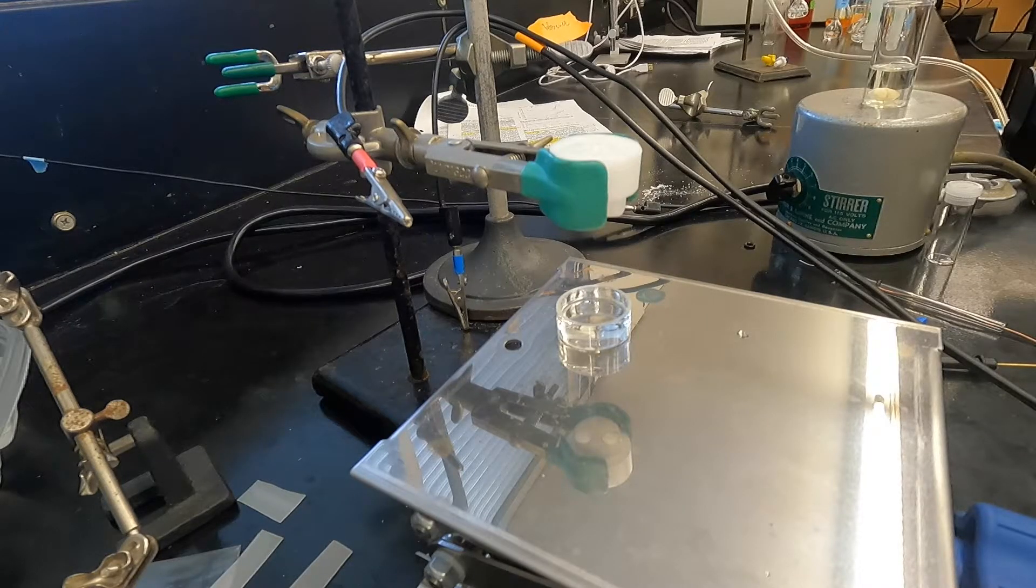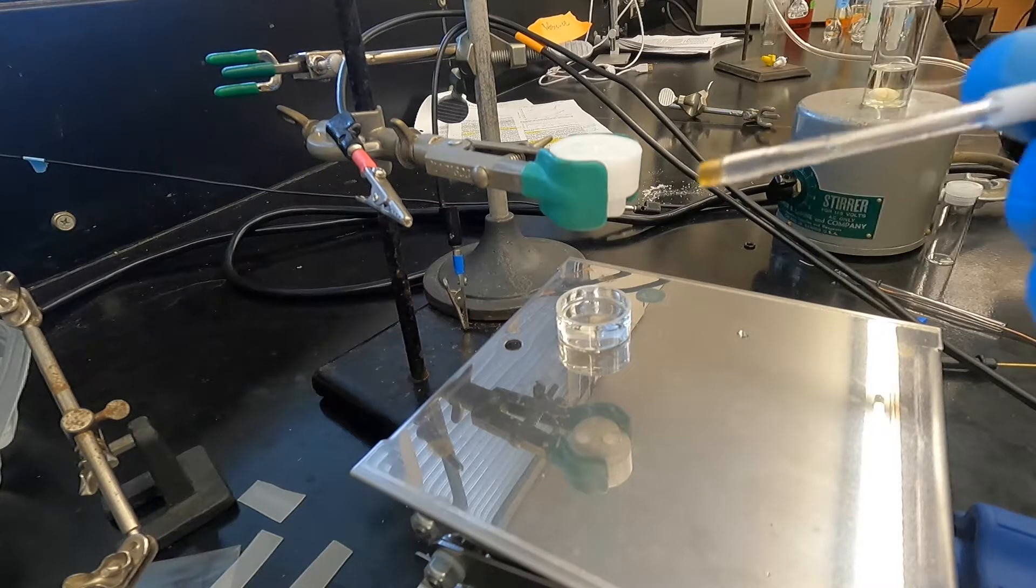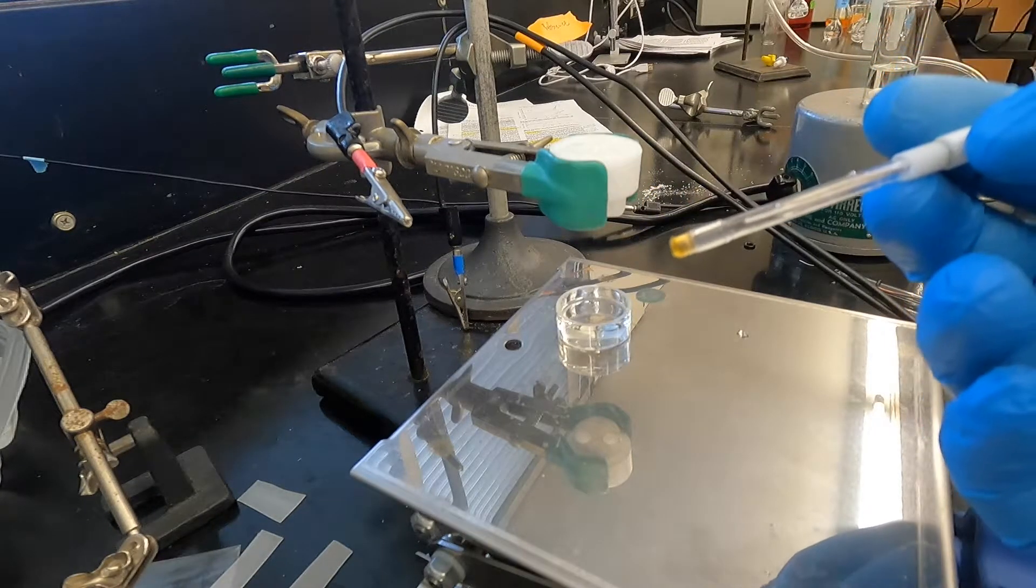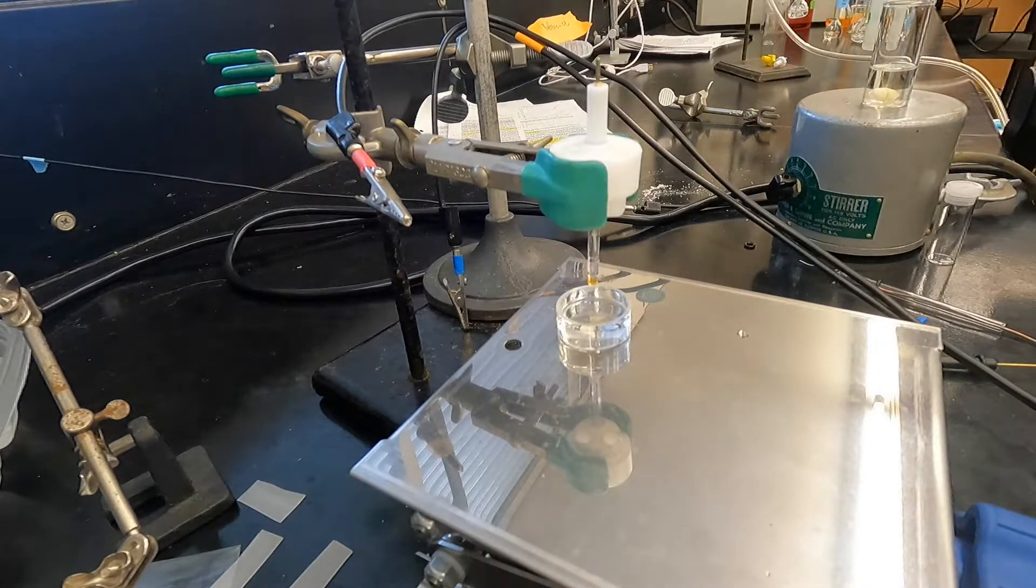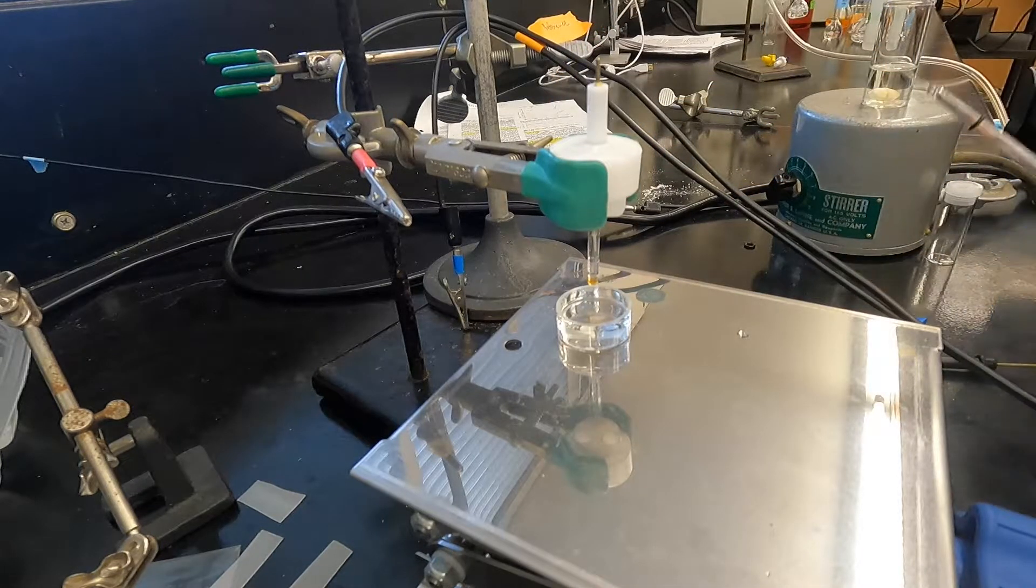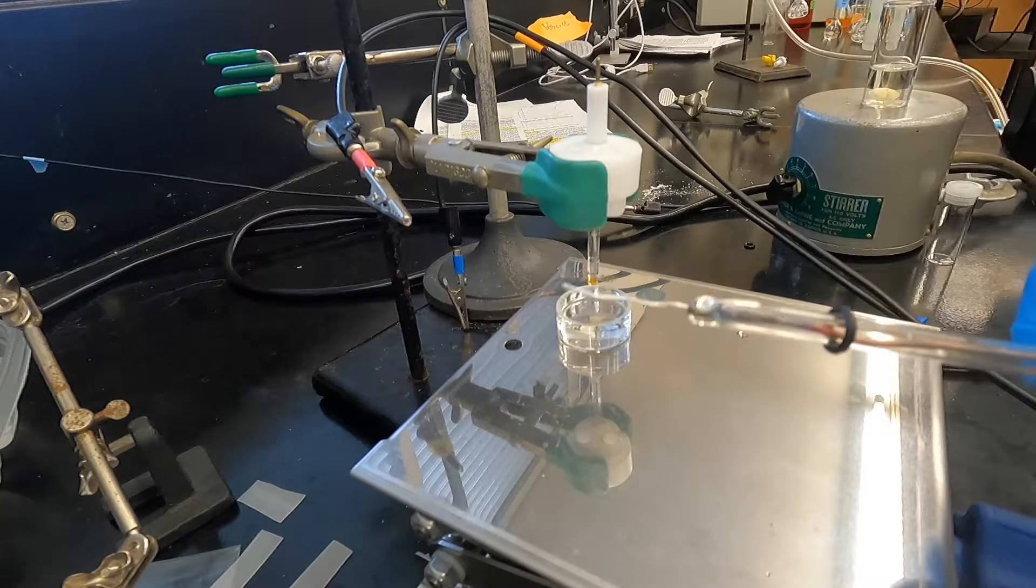You're going to set up a standard cell over at the GAMRI. You're going to drop in a reference electrode that you want to check, make sure it's clean, and then you're also going to drop in a platinum wire counter electrode.